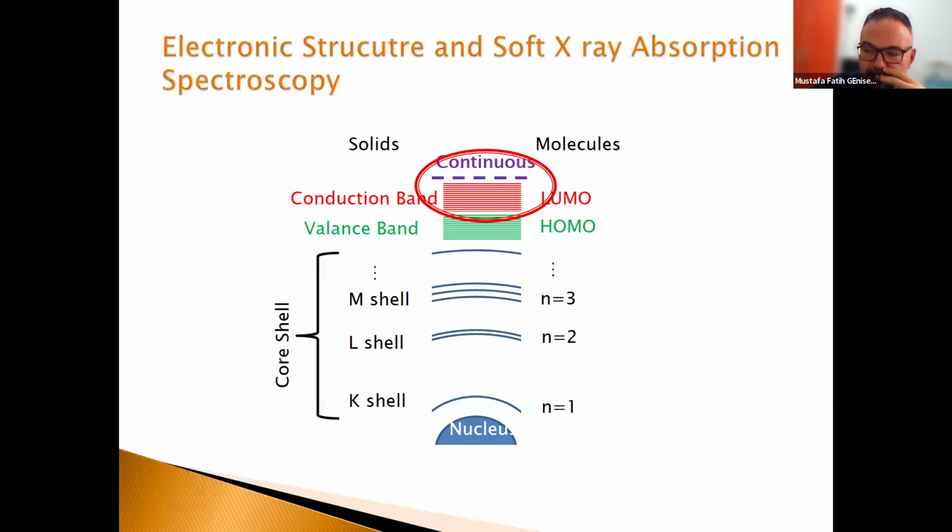But if it is really a mixed oxide, for example iron(II) oxide and iron(III) oxide together, I ask people to bring some references, for example an iron oxide reference, an iron(II) oxide reference, and an iron(III) oxide reference, and compare them. That is the idea.